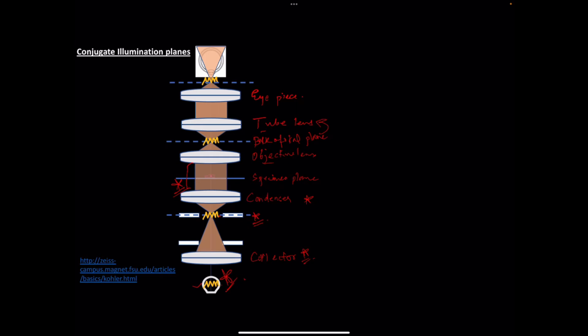The back focal plane of the tube lens is where your objective is again going to focus the image of your filament. Now, since it is again at the back focal plane of your tube lens, what will happen? It will again pass it on to the eyepiece as a collimated beam of light, or a defocused beam of light. This parallel beam of light is very important for incorporating the filters that you want to incorporate, and all of these filters can be placed in this parallel beam of light, and it will not obstruct anything here.